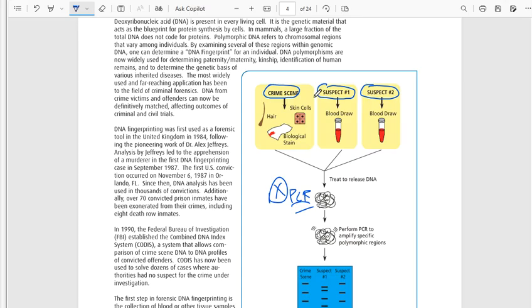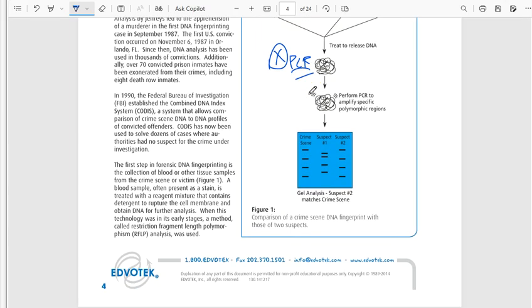So we have taken these samples in the lab. We have now amplified them, PCR'd them, and this was done off camera. You did not see this. We obtained the samples after the PCR took place. That's kind of where we started and picked up.